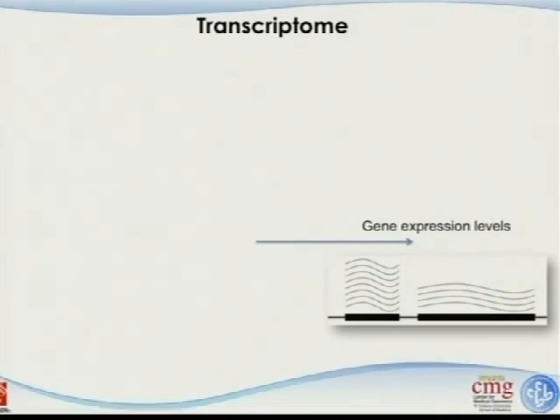But yes? Microarrays don't do a very good job of that. You can see that. But because they have to hybridize, yeah, the design of the probes affects the sequencing. So with RNA sequencing, you have mappability issues and some other issues as well, right? But the point is that they are in the same market. They are solving the same level of biological problem, which is the gene expression levels, okay?